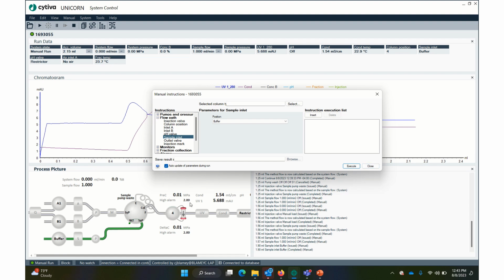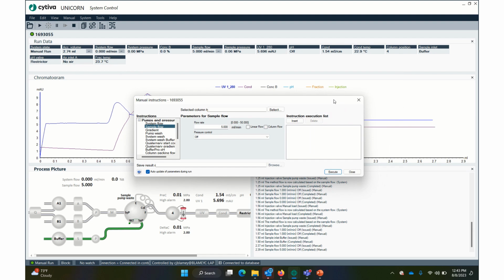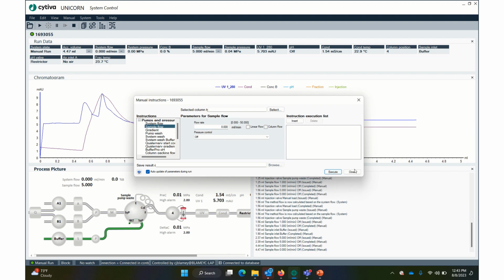In fact, since we're not running over any of the columns right now, I'm just going to bump up the flow rate. And we're also not running any sample over the system right now either. It's just solution, so we have plenty of solution. Just going to take a mill or two. Okay, that should be good enough. All right, so let's actually start the method now.